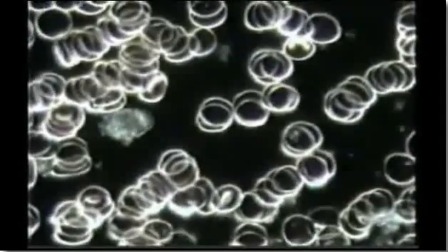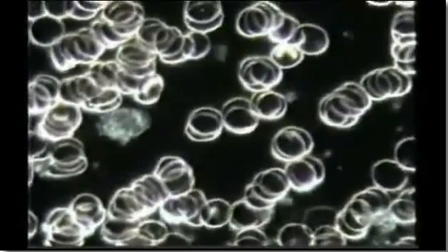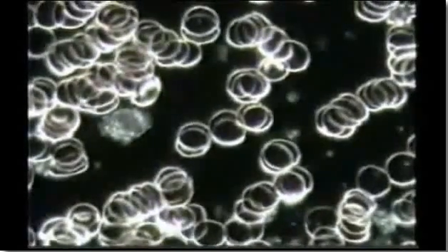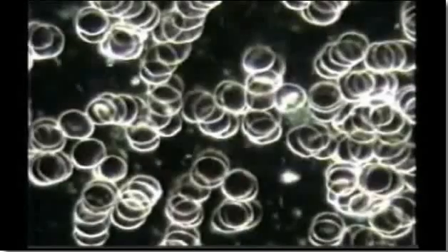Subject number 2 has tried the pendant. Before the use of the pendant, we can observe the red blood cells that are stacked. We barely see protein particles or regulators in the plasma.